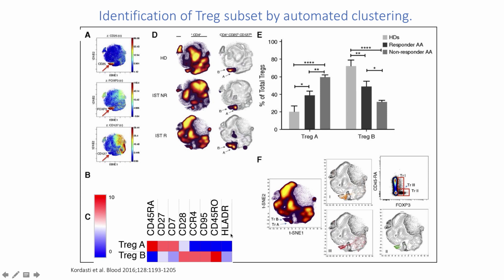You don't need a very big panel to identify them. And the other aspect is, when you use this pipeline for identifying these two subpopulations of Tregs, you can see that population 3, what we call population 3 Tregs, are a combination of non-Tregs, and the rest of them very much similar to population 2. It seems like this Treg population 3 is a combination of population 2 and non-Tregs, which are shown here in red. Therefore, more or less, you can have two main populations of regulatory T cells.